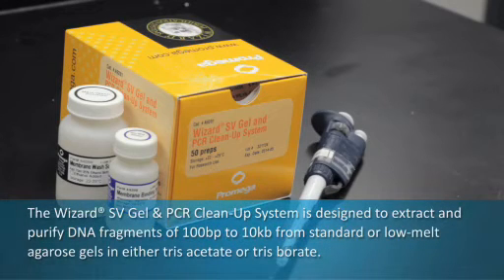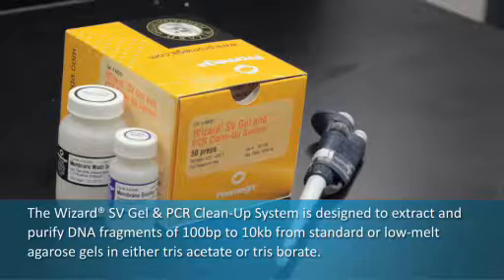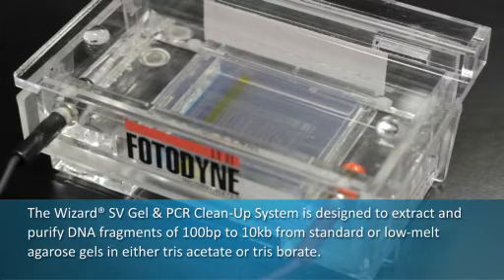The Wizard SV gel and PCR cleanup system is designed to extract and purify DNA fragments of 100 base pairs to 10 kilobase pairs from standard or low melt agarose gels in either tris acetate or tris borate.